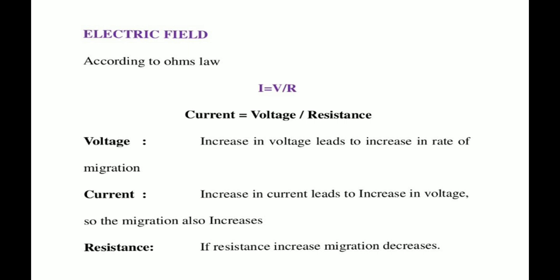Got it? Now, the resistance increases with the length of the supporting medium but decreases with its cross-sectional area, and with an increase in buffer ion concentration. You can also say that with an increase in temperature, your resistance will decrease.